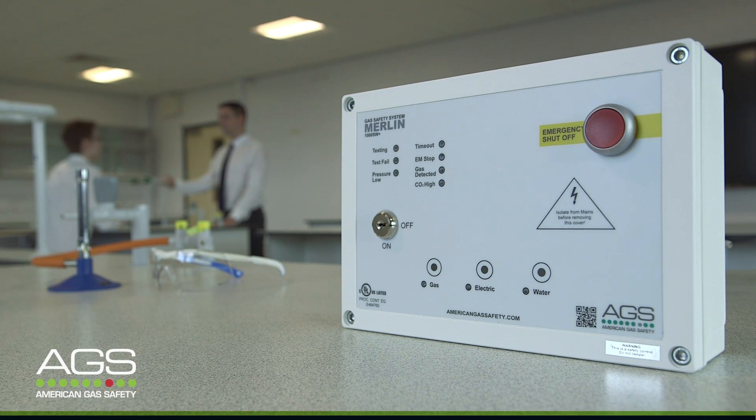American Gas Safety is proud to introduce the Merlin range of Science Lab utility control panels incorporating gas pressure proving. We have utilized modern digital components to produce a product that is not only cost effective, but that also offers a higher level of security and safety to the educator, students, and the building.